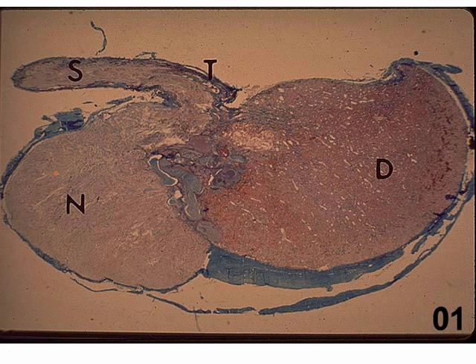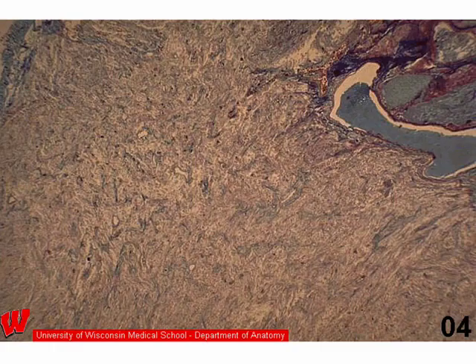What we're going to do now is to look at a region of the pars nervosa at slightly higher magnification. This slide shows you a region of the pars nervosa. We're still at low magnification. It's very difficult to make out nuclei here. Indeed, this portion of the pituitary is almost exclusively made up of axons.